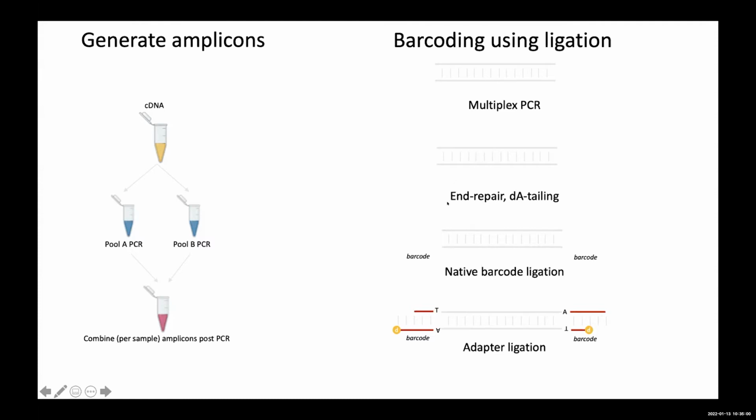Obviously, it also performs 5' phosphorylation for ligation, and then we do this ligation using T4 DNA ligase, and you get effectively a barcoded amplicon pool. And you can do this with 12, 48, 96 different barcodes on a plate before you pool them together to create your multiplex sequencing library.